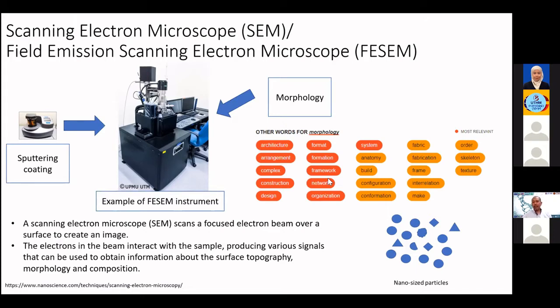And FESEM is actually important for nanoparticles, because we want to know the particle size, and a typical microscope we cannot use, because the particle is very small.